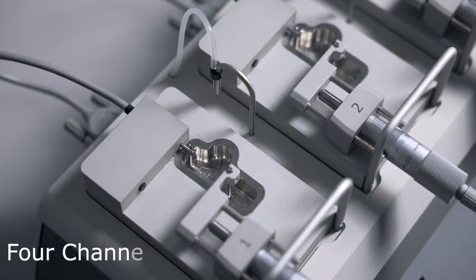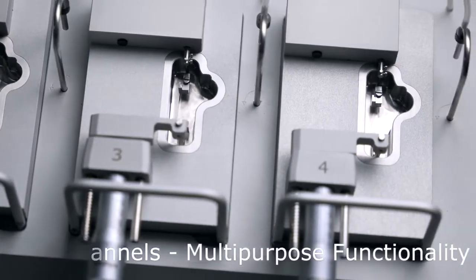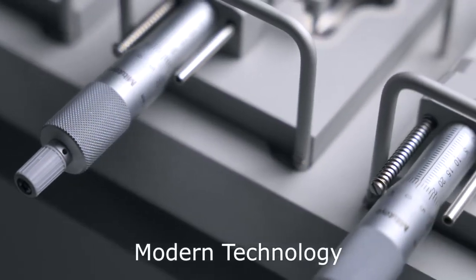You can easily swap mounts for either rings or muscle strips, or even have them side-by-side. The micrometer allows for smooth and accurate tissue adjustments.